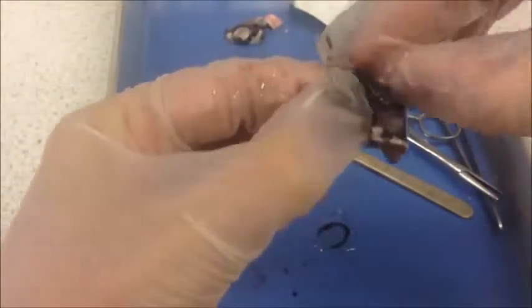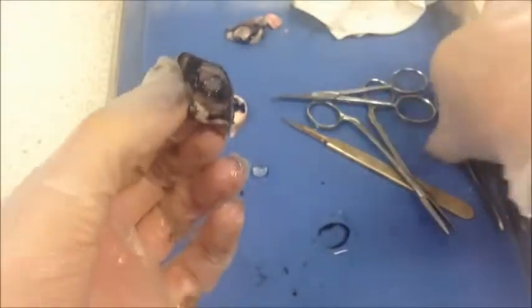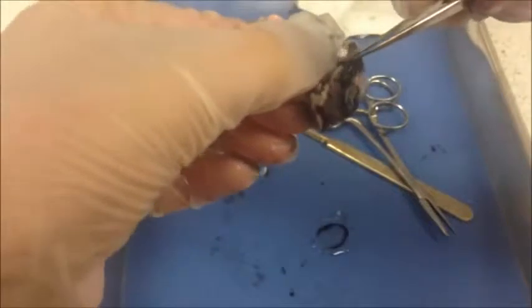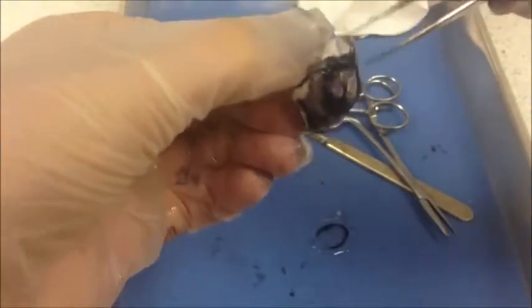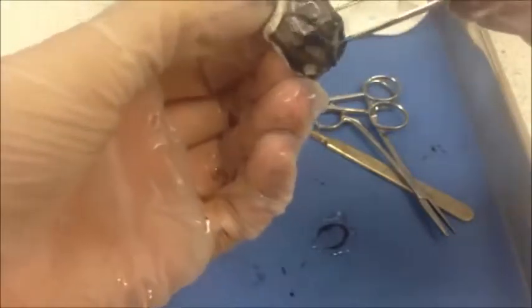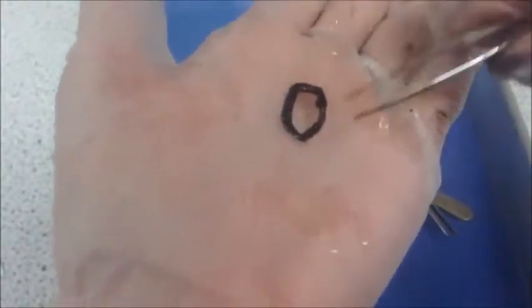Picking up the front of the eye again, you can see the iris, which is a coloured part around the pupil. I'm trying to gently peel the iris away from the front of the eye. The iris is made up of muscle which contracts two ways to allow less or more light in. If someone shone a torch close to your eye, your pupil would suddenly get really small. That is because the iris muscles are decreasing the size of the pupil to let less light into the eye, so it doesn't get damaged.